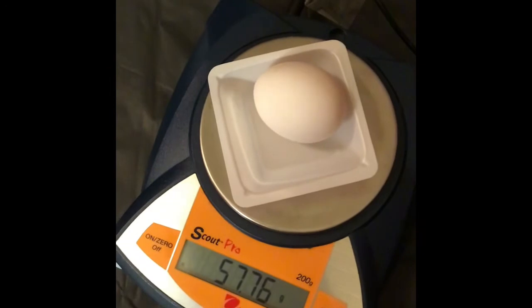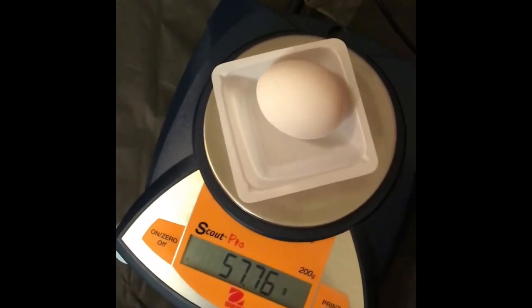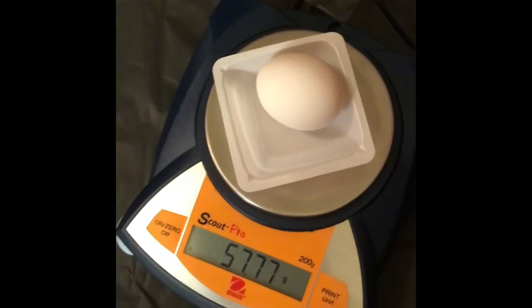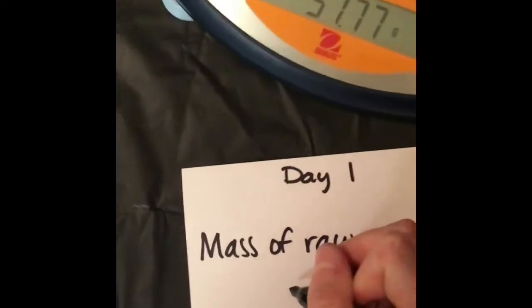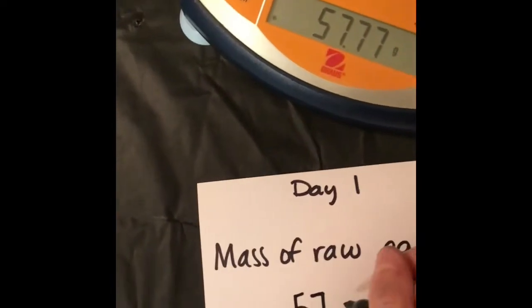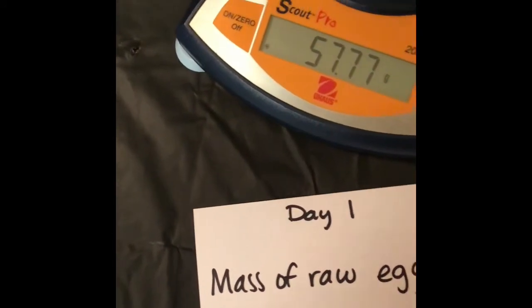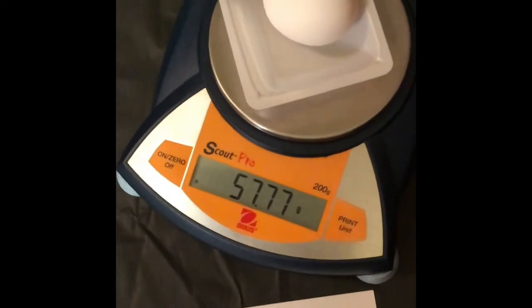My initial mass of the egg is 57.76. That will be recorded in your data table. Again, 57.76. The balance is wobbling just a little bit, but we're going to go ahead and keep that. This is a measure of mass, so our unit is the gram. Now we've got the mass of our starting egg.